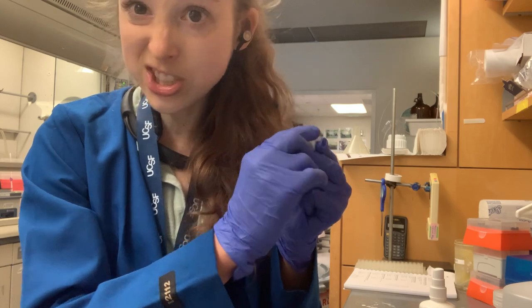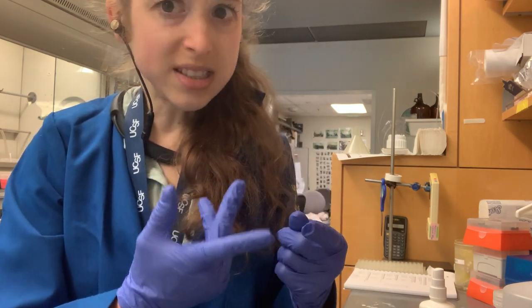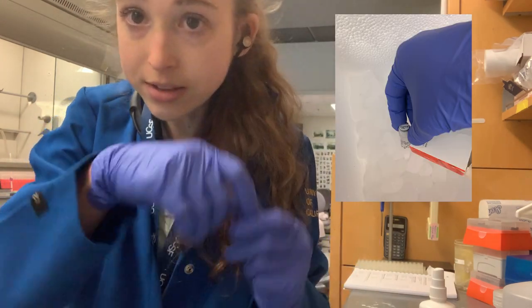Thankfully with these, the lids are attached. Although sometimes you have ones that screw off. Sometimes when companies sell tubes in a kit, they sell tubes with nothing on the top and a screw lid.